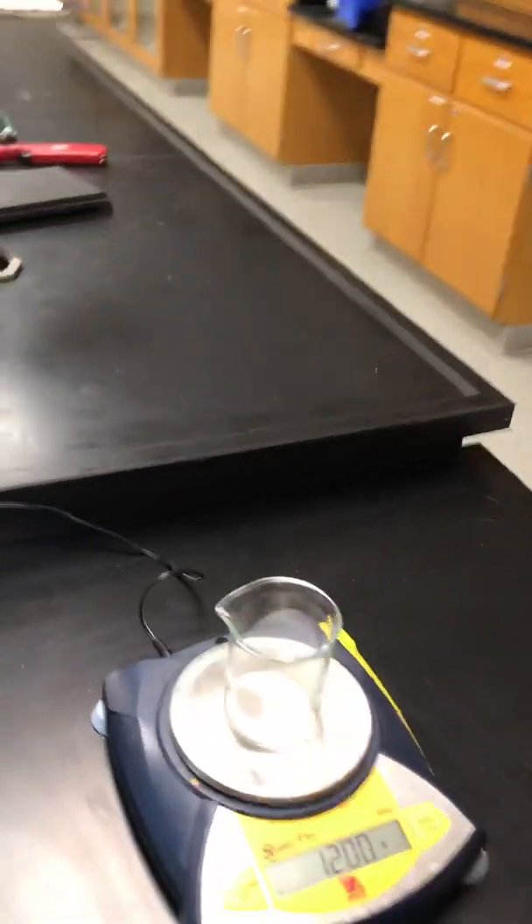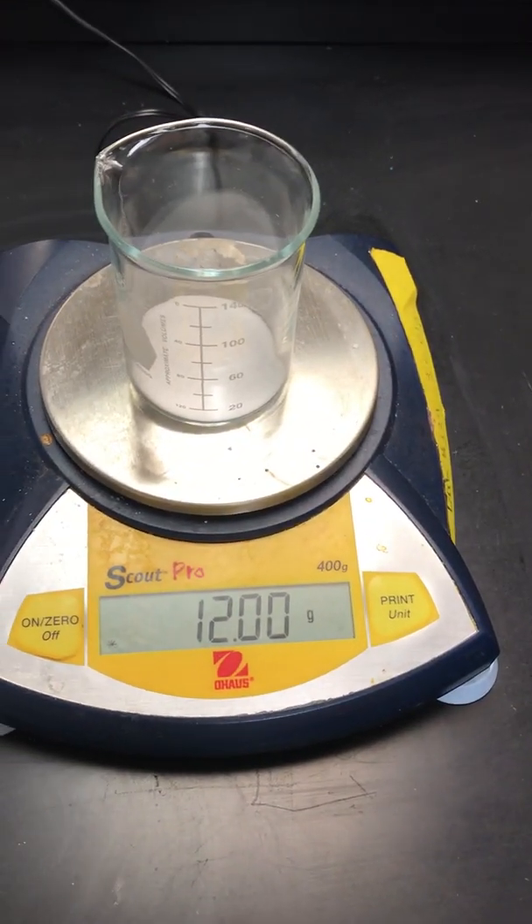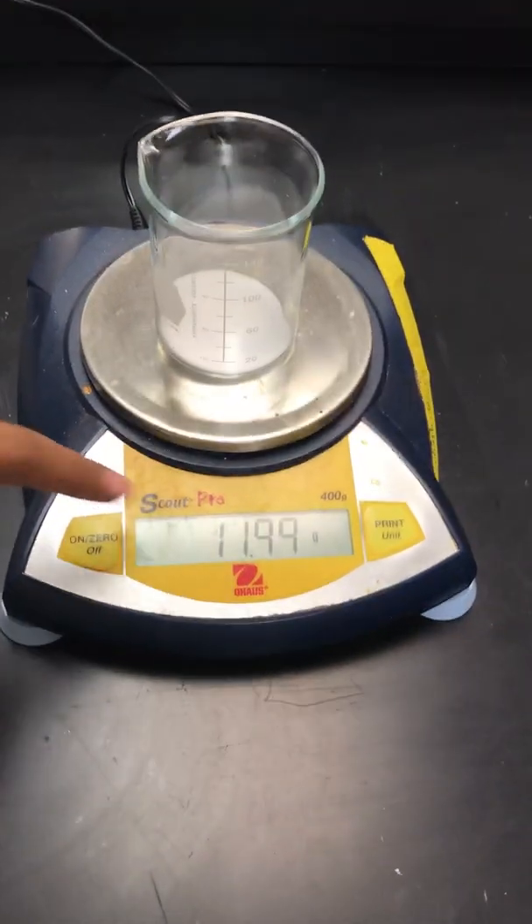What did you get? I got 12. Exactly? I got 12 exactly. No! Now it's 11.99. No, it started at 12. Record 12. Record 12. That's what it said at first.